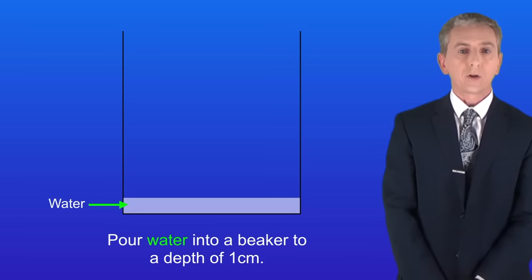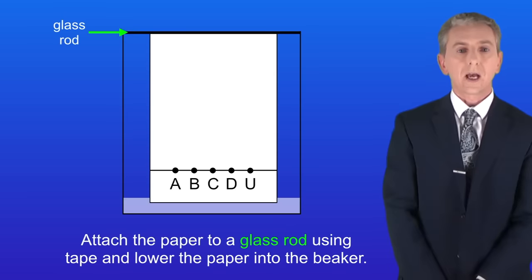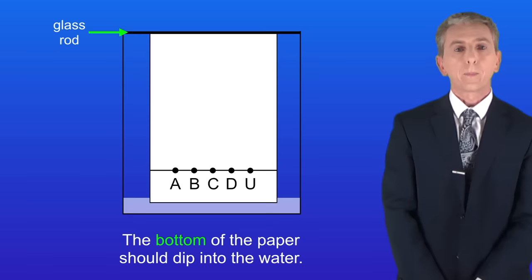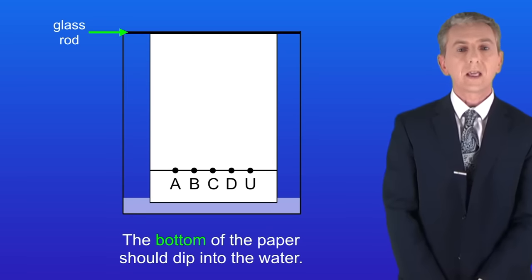Now we pour water into a beaker to a depth of one centimeter. Remember that in this case the water is the solvent. We now attach the paper to a glass rod using tape and we lower the paper into the beaker. The bottom of the paper should dip into the water.